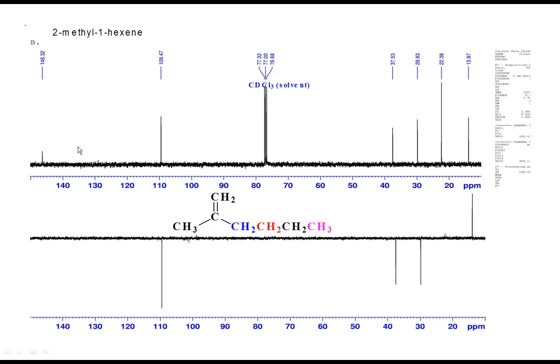Anyhow, this is a spectrum for this compound. This is the DEPT 135. As soon as I see these negative and positive peaks, I know that this is DEPT 135, because no other DEPT would give you a negative peak, right?